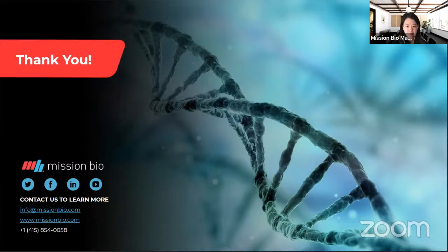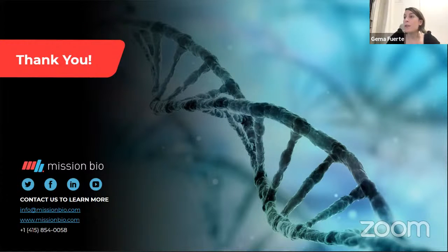How many samples can be analyzed in the Tapestri platform simultaneously? In Tapestri Insights 3.0, you can add multiple time points. The idea is that the samples you analyze together belong to the same patient. If you have, for instance, 4 or 5 different time points, you can analyze them together, but all from the same patient. That's where you will get the best of it.